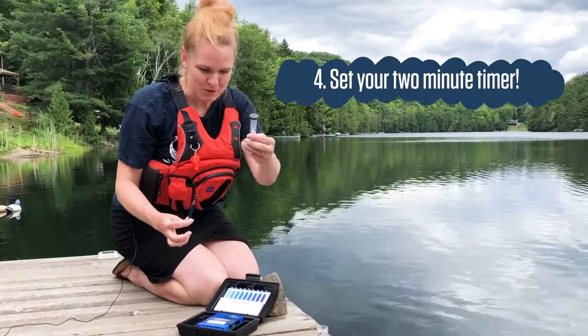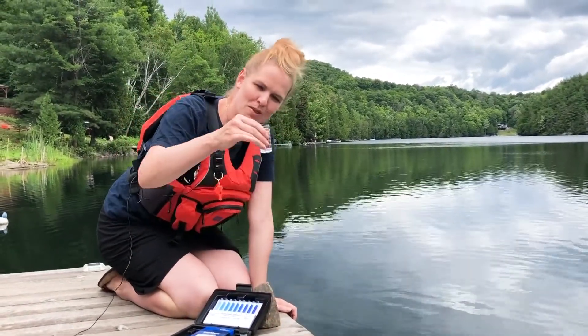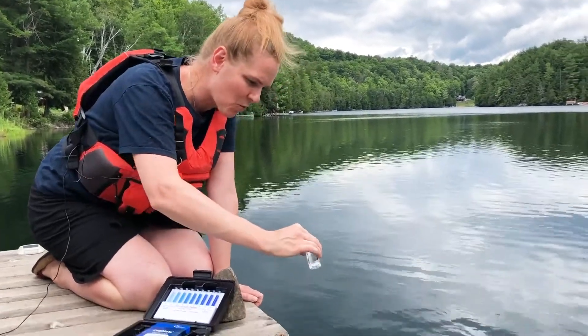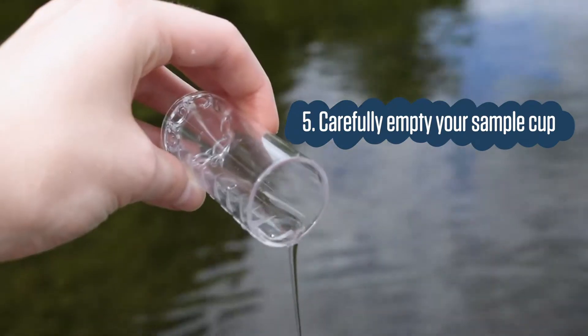Now I'm going to set my timer for two minutes. While I'm waiting, what I usually do is pour the water out. The tip is still in there, so you're going to pour the water out super slowly so that the tip stays at the bottom. Then we'll dispose of that after.